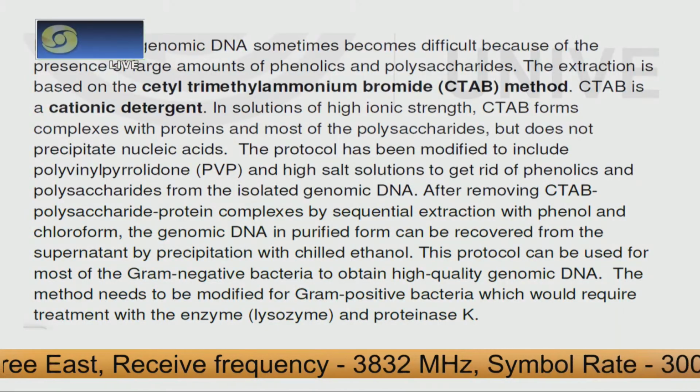So when you are preparing the extraction buffer, make sure that it has the CTAB together with the PVP. You have to prepare the extraction buffer containing these particular chemicals, that is the cationic detergent CTAB, together with the PVP.